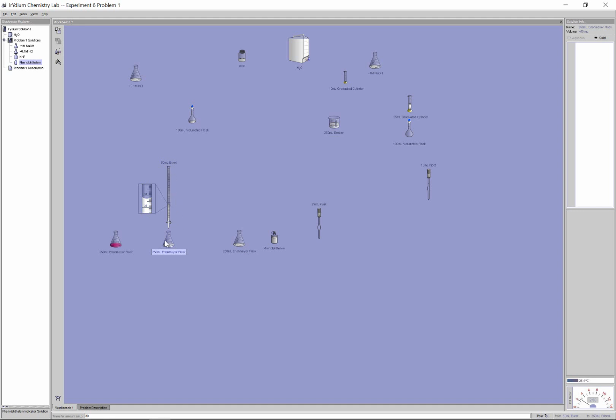Now I do want to do a little more fine tune. That one I accidentally overshot. Now maybe it's somewhere between 30 and the 33 that I calculated. Let me just drop it in, let's say 1 mil at a time. So just pour it in. So this would now be 31, 32.